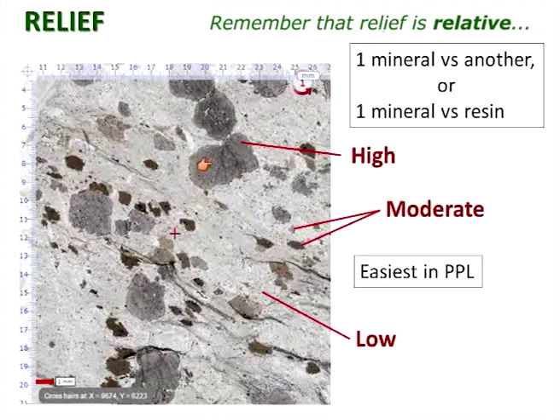So that's one mineral. And then you can see possibly another mineral, which is a dark brown mineral like this. And that again has what looks like fairly high relief, moderate to high relief, but it's very strongly colored, a brownish color. And that tends to form crystals which are slightly smaller than the other mineral. You might also pick out that there are changes in color as well. There are some paler brown crystals here, and in fact there's a whole spectrum of these crystals running from the darkest brown to the palest brown. And again, that's a relatively easy mineral to identify.